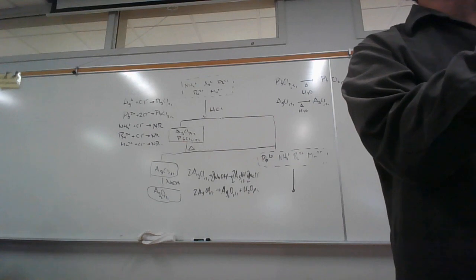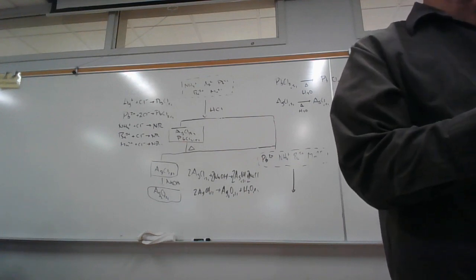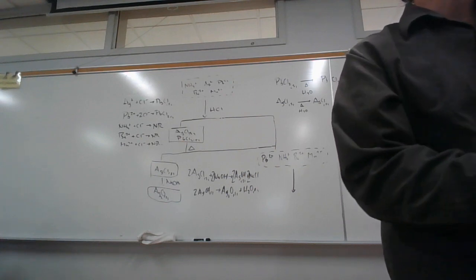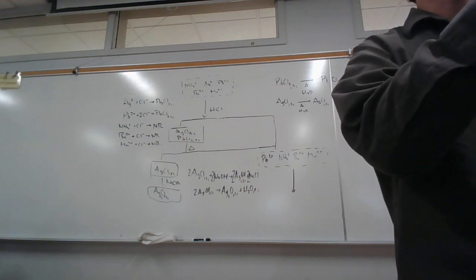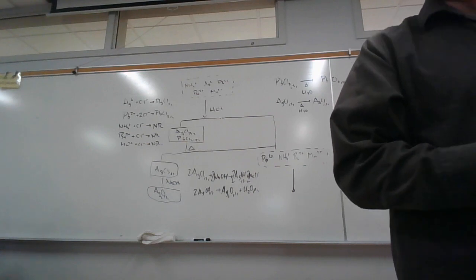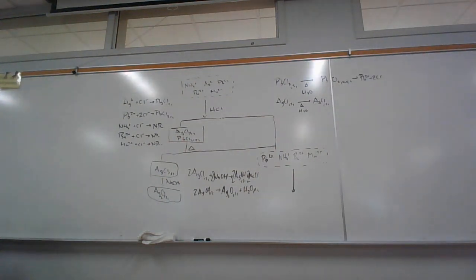So fold it in half and then fold it into a quarter. And then what people do is they'll put 3 layers of filter paper on one side, 1 layer on the other side, and then jam it in there. Some people tear off a piece on the end, you know, tear off a small piece. I don't understand that. I mean, I did it, but I really never got why I do that. And so I stopped doing it.